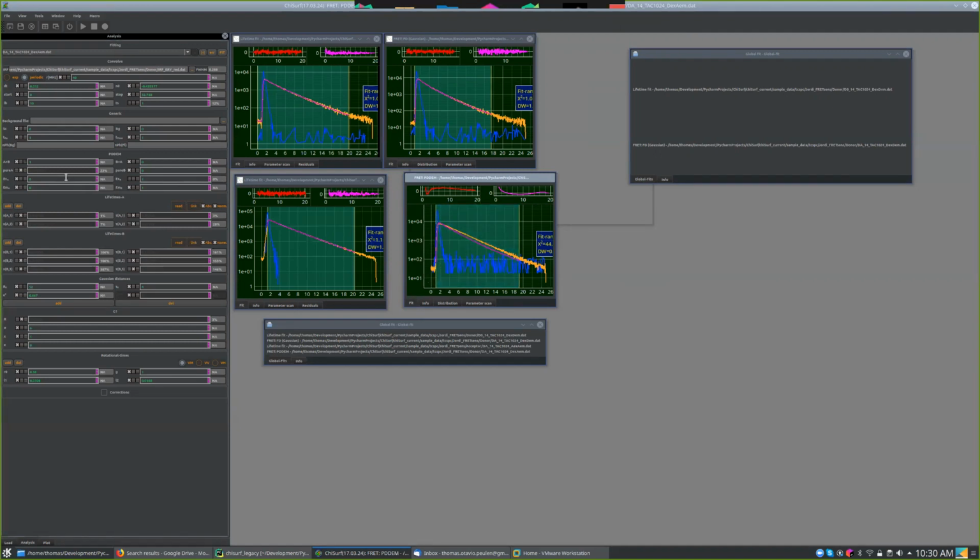And now let's look how the donor only looks like. I just put 1, 1 here and 0, 0 here. And this is the donor only with FRET. And yeah, you could also not describe that with these numbers. So let's look now for the donor only, if it would be an only donor only. And like also like this, you could never describe this decay as it is. So meaning what we have here is very likely kind of like low FRET, I would guess.